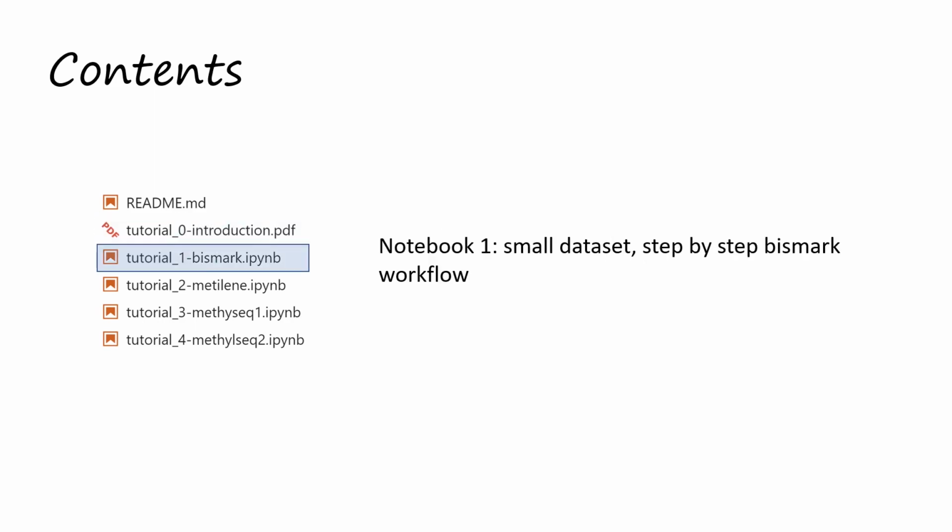The first data analysis submodule is Tutorial 1. We also refer to it as Notebook 1, Lesson 1, Submodule 1. This notebook will use a small dataset and analyze it using the Bismark workflow step by step.